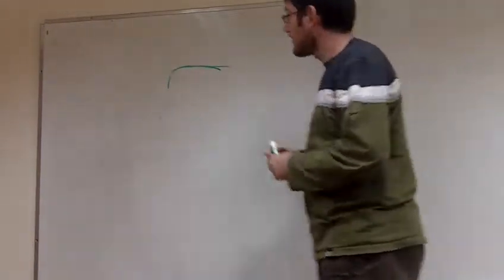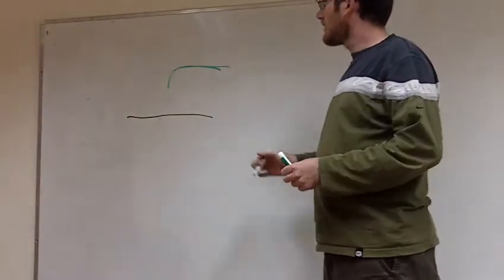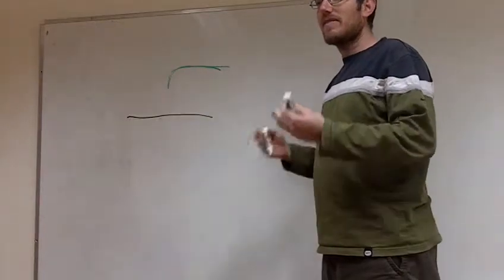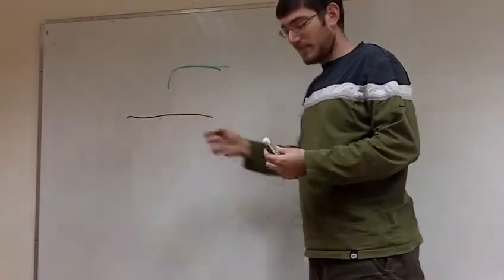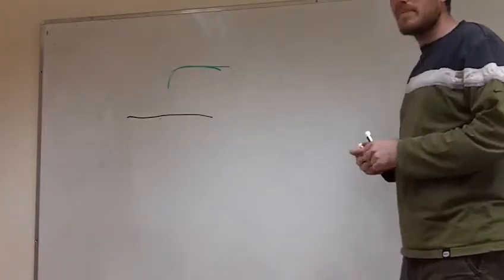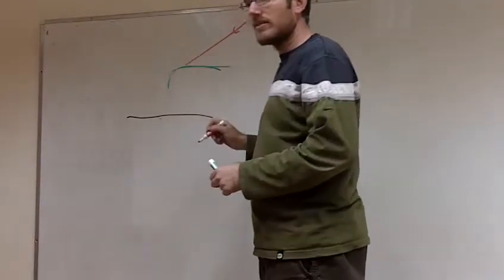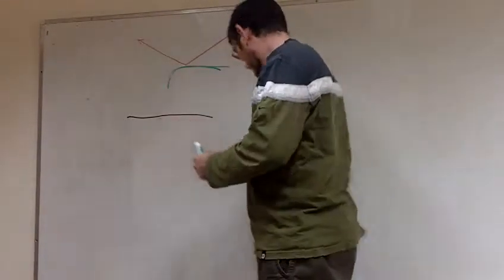At the bottom, we have our sample. Now, we want the tip to be in contact with the sample, but how do we know that it's in contact with the sample? We have to have a certain feedback, something which is going on that we can know that the tip was in contact with the sample. So in the MV1000, we have what's called the beam bounce. We have a laser which comes out, it hits the cantilever, and then it bounces off onto a detector.